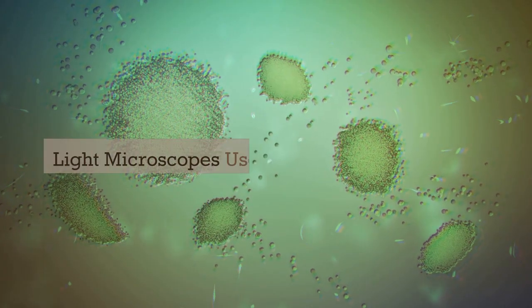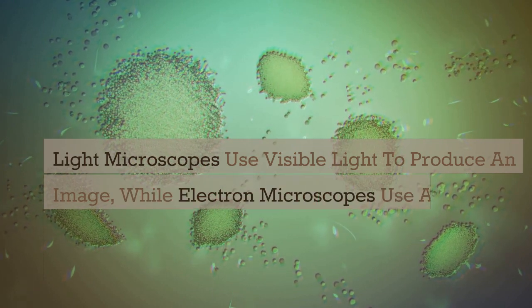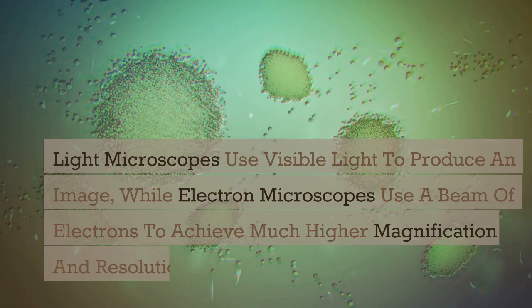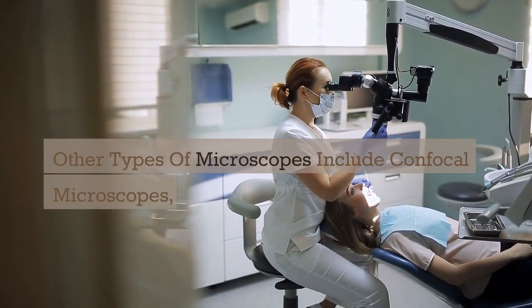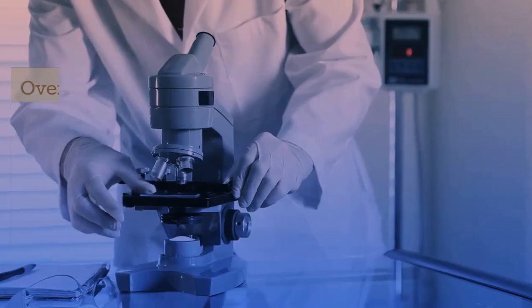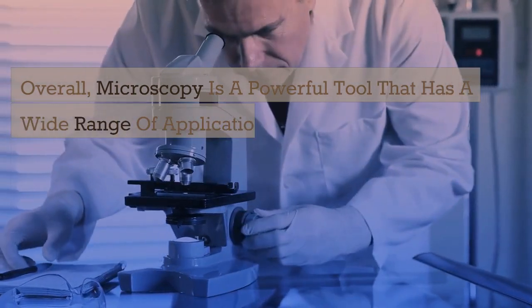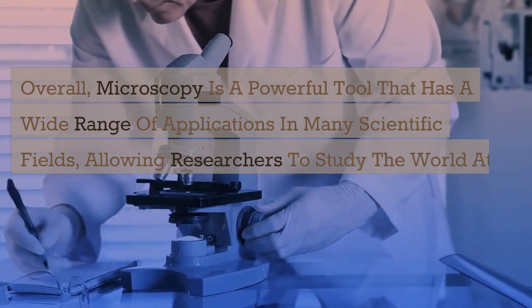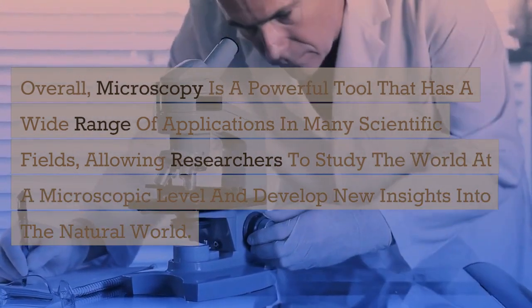Light microscopes use visible light to produce an image, while electron microscopes use a beam of electrons to achieve much higher magnification and resolution. Other types of microscopes include confocal microscopes, fluorescence microscopes, and scanning probe microscopes. Overall, microscopy is a powerful tool that has a wide range of applications in many scientific fields, allowing researchers to study the world at a microscopic level and develop new insights into the natural world.